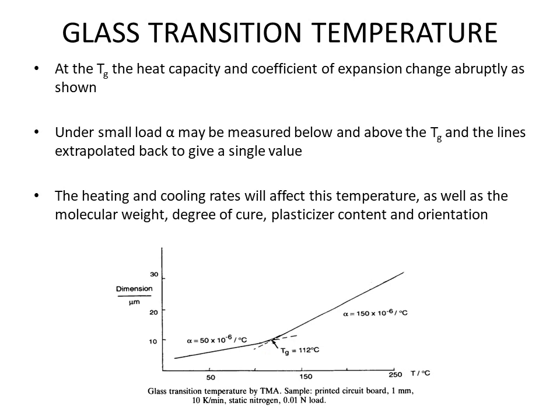The heating and cooling rates will affect this temperature, while other factors which may affect it include molecular weight, degree of cure, that is cross-linking, the plasticizer content, and the orientation of our sample.